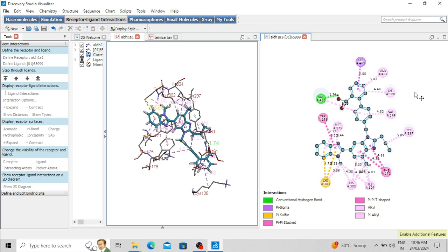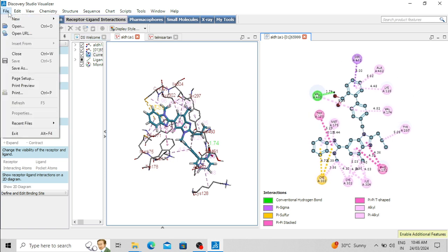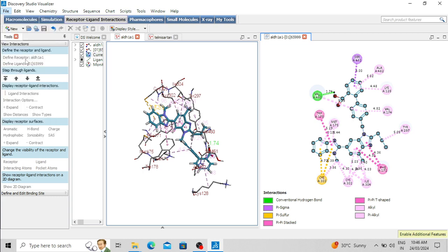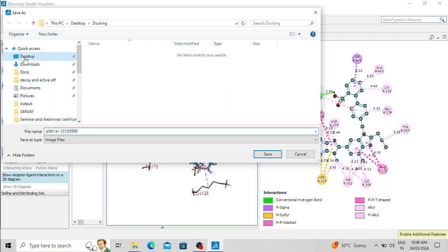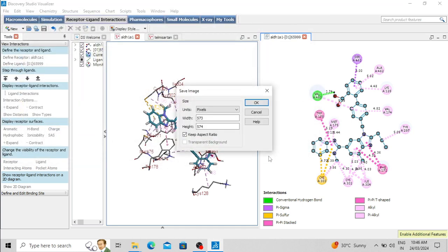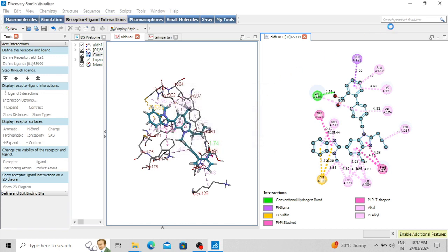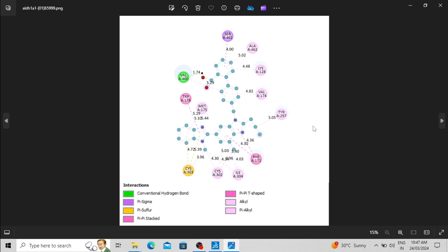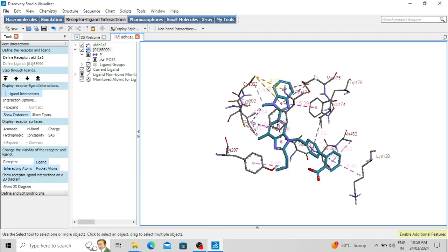To save these images, go to File and click Save As. Select the folder — here I am selecting the desktop — give it a name and save it as an image file. Click Save, then change the width and height; it is better to select 4000 pixels because that gives the highest resolution. Click OK and the image will be saved. You can see the two-dimensional interaction diagram between aldehyde dehydrogenase 1A1 and telmisartan.